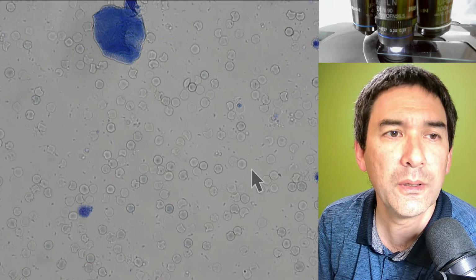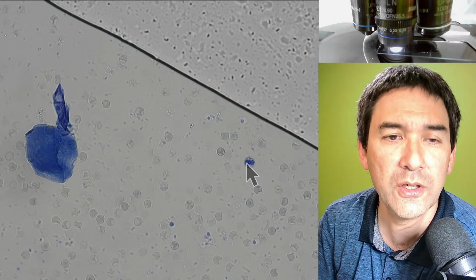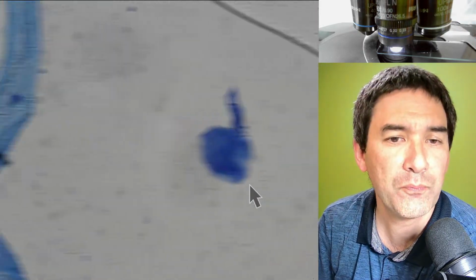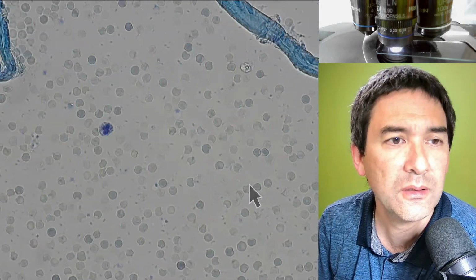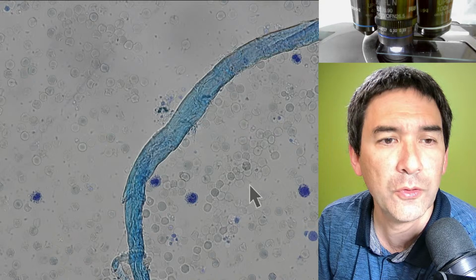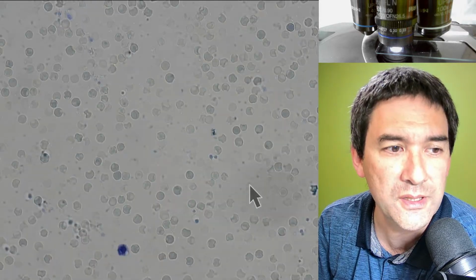Here, for example, at the top, this huge blue thing on the left, we ignore. This one, for example, you see that the nucleus seems to have 2 lobes or 2 parts. We basically ignore this contaminant. Here again, a white blood cell. Again, you see that the nucleus seems to be lobed. Here are a couple of white blood cells as well. And essentially by staining this, you can actually do a white blood cell count.